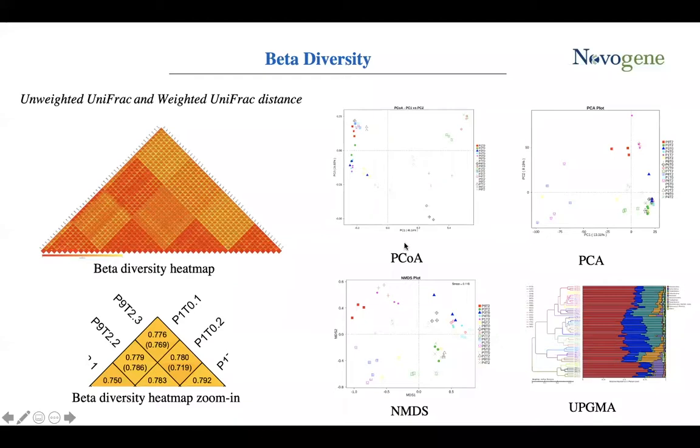And the principal coordinate analysis, the PCoA, is an ordination technique which picks up the main elements and structures from reduced multidimensional data of the eigenvalues and eigenvectors. The technique has the advantage over PCA that each ecological distance can be investigated. And weighted and unweighted UniFrac are calculated to assist the PCoA analysis.